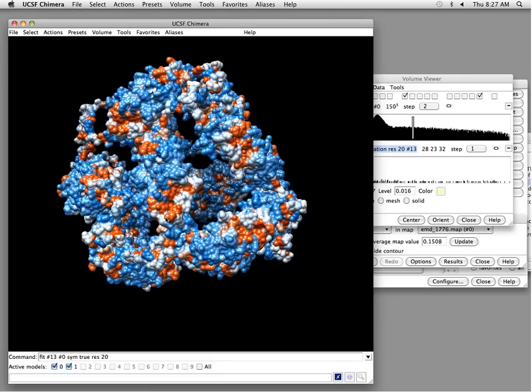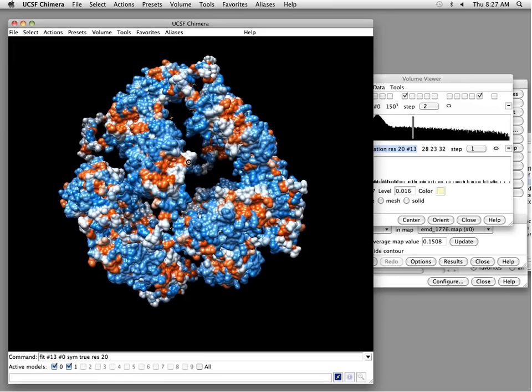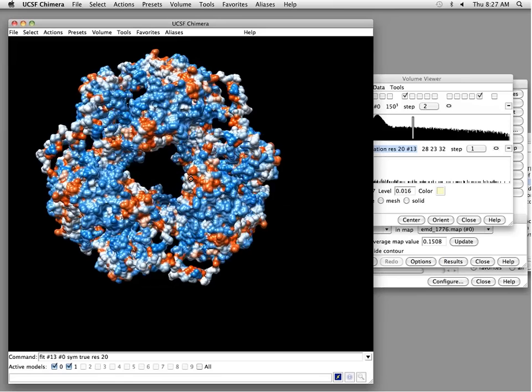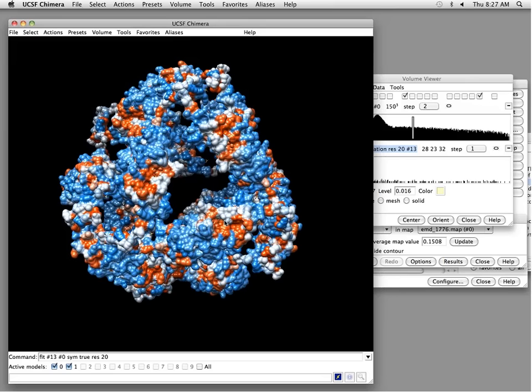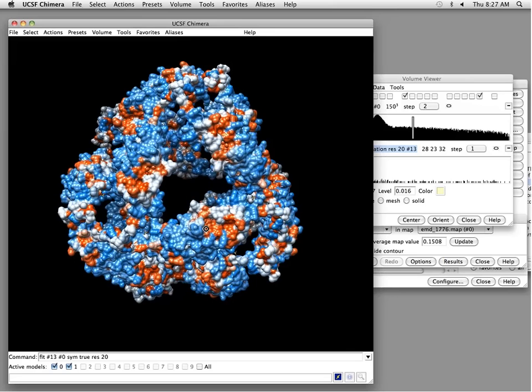If we did that little part of the modeling that I just described, where we placed the C-terminal tails, we would find that those tails actually lie in the little orange groove that you see on these surfaces. Okay, see, there's a line of orange, and we see many copies. Every monomer has one. Basically, all of the hydrophobic part is lined up. And the C-terminal tail sits right there covering that orange groove.